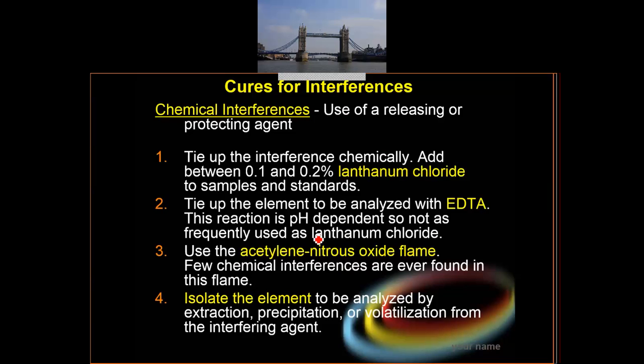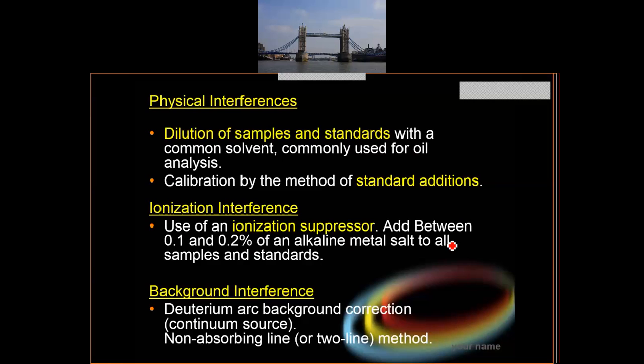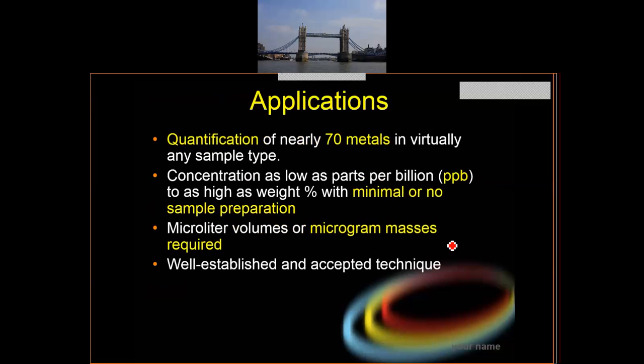Okay, baca. And one that can easily be remembered is lanthanum chloride, the usage of lanthanum chloride inside the sample. Lanthanum chloride is being used to, not purify, to make the pool water clearer. Kan orang letak dalam air kolam tu lanthanum chloride untuk bagi dia jernih. Or EDTA, this is a lot in food. Okay. Ini boleh baca, ni sama dengan yang saya cerita tadi.